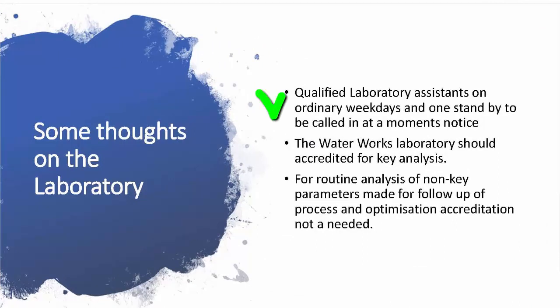First, qualified laboratory assistants on ordinary weekdays, and also standby to be called in at a moment's notice if something happens in the process. The Waterworks laboratory should be accredited for key analysis. That goes for the Waterworks laboratory. I need to point out that we are talking about a wastewater treatment plant lab as well as a Waterworks lab.